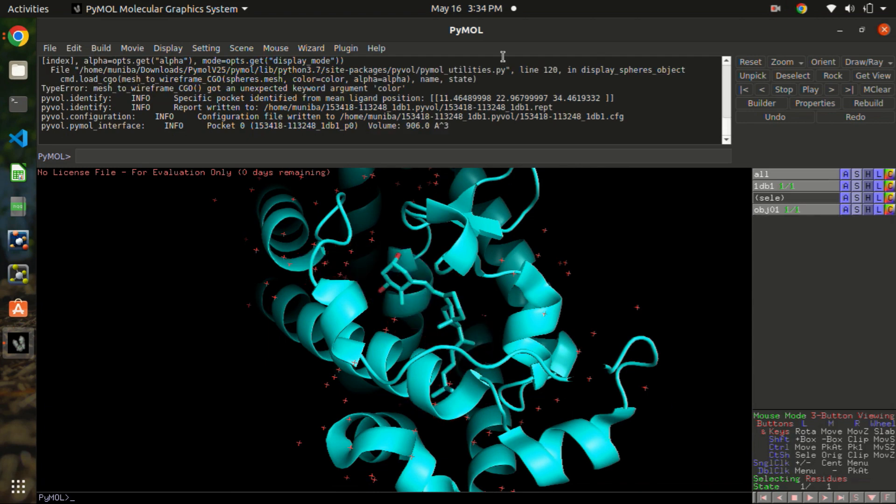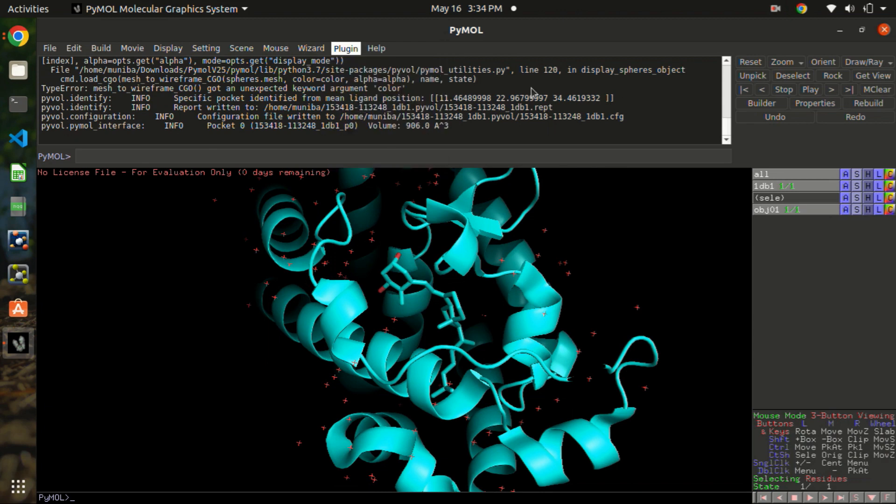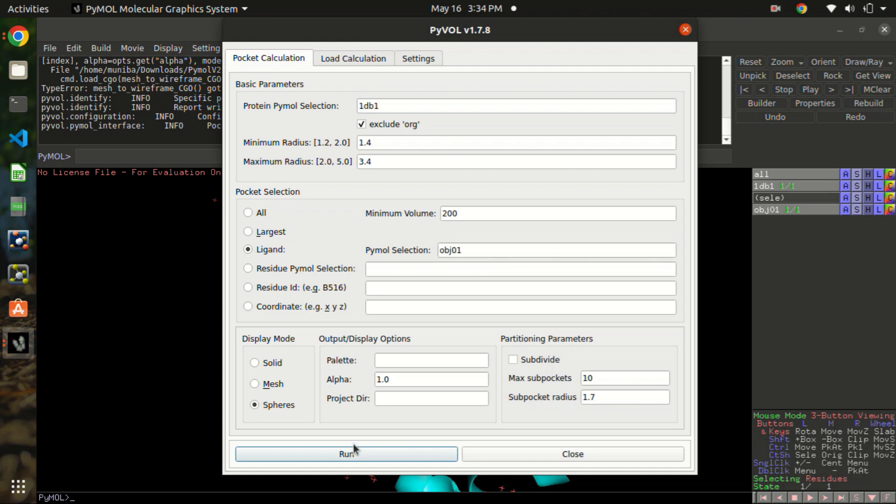Now if you want to change the display mode, then just simply go to the plugin again, enter these values. Ligand is obj01. And I want spheres, for example.